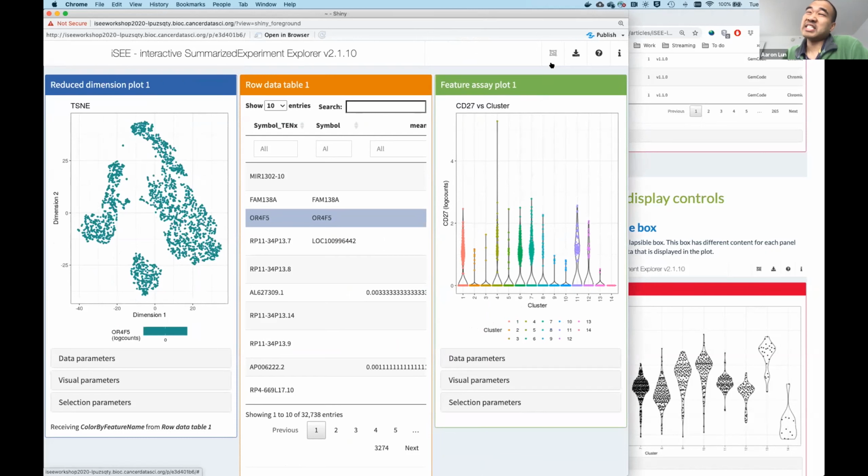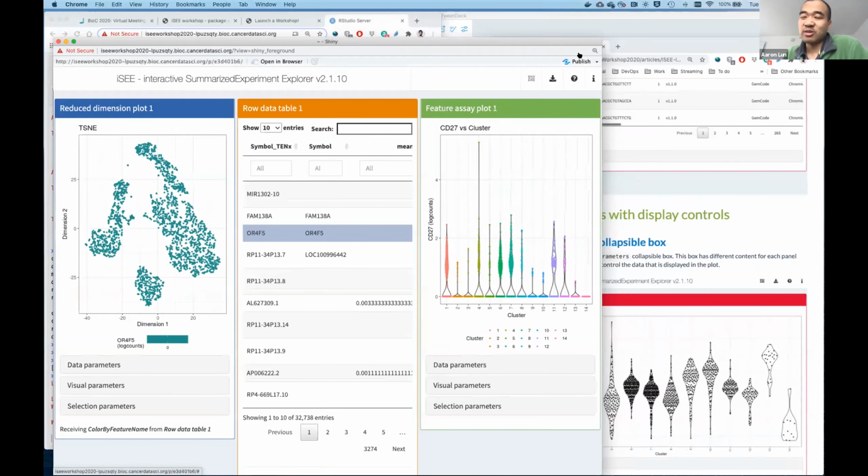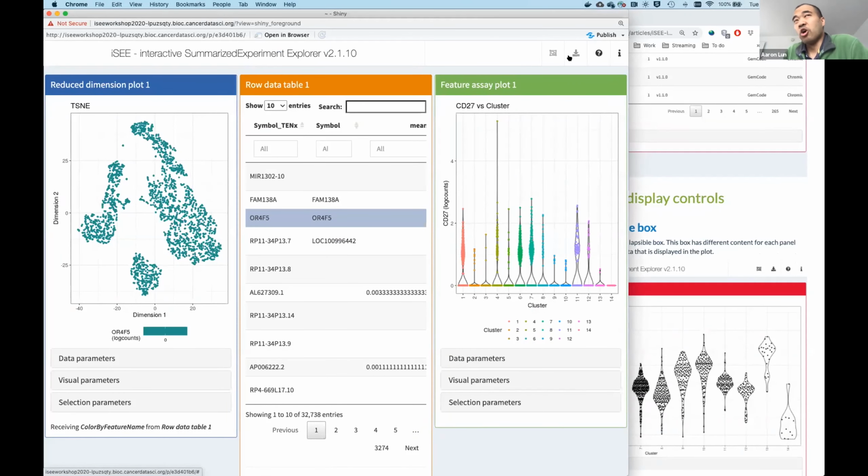You mean a list column? I'm interpreting a list column as a column where you have one list per row of the data frame. That's how I understand it. So in these default panels, at least, they don't know how to deal with that, so they'll just ignore it. Of course, you can write your own panel that knows how to deal with it.